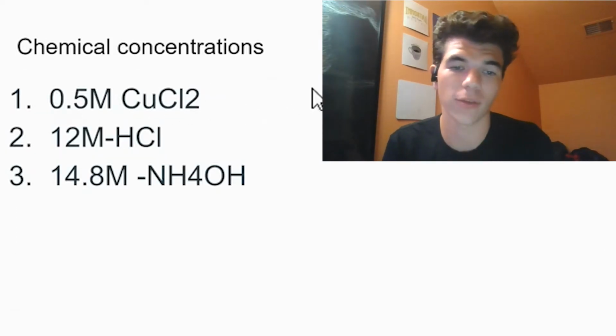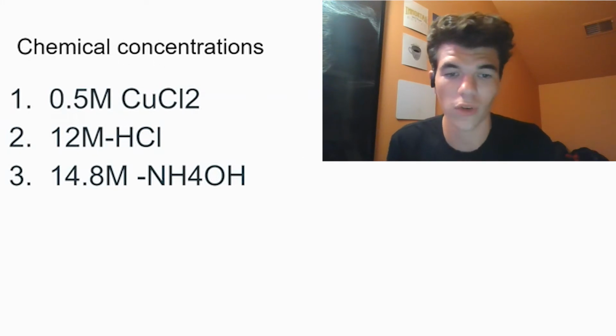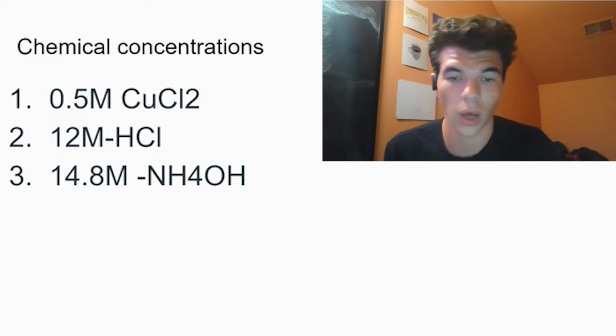Using 0.5 molar copper chloride, 12 molar hydrochloric acid, and 14.8 molar ammonium hydroxide.